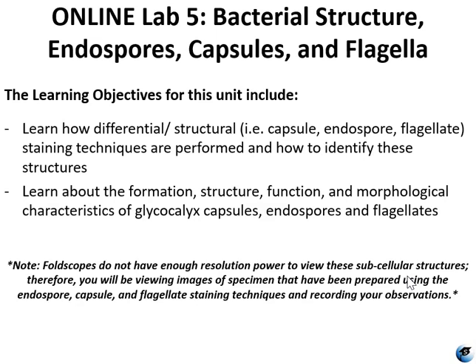I wanted to note at the start here that since the Foldscope instruments we use for the online labs have limited resolution power, we will not be able to perform the stains and view these structures in a hands-on lab situation, but you will still learn about them and you still need to be able to know the steps of the staining procedures and be able to identify and describe the structures from figures and photographs.